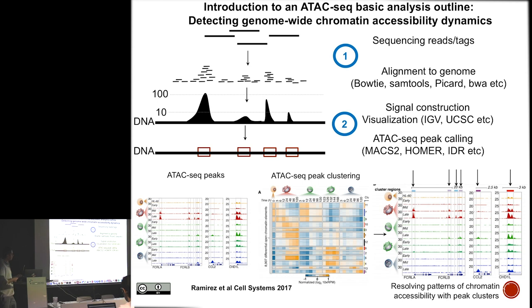As an example to show how I think about ATAC-seq when I analyze it, from my PhD work, I did a differentiation of human myeloid cells and profiled by ATAC-seq along the differentiation from this progenitor. In this really simple example, I'm showing chromatin accessibility for the progenitor, macrophages in red, monocytes in green, another macrophage subtype in green, and then neutrophils in blue. I'm showing three representative loci, where this locus shows a macrophage specific, and a neutrophil specific, so these are cell type specific open chromatin regions. And then this last one shows kinetics or dynamics of open chromatin.